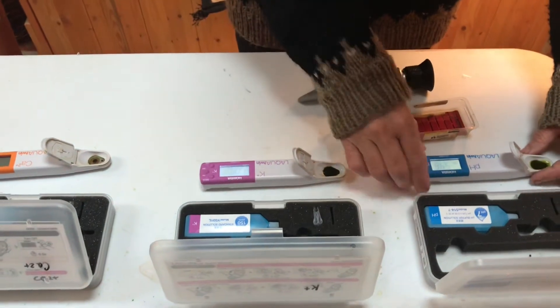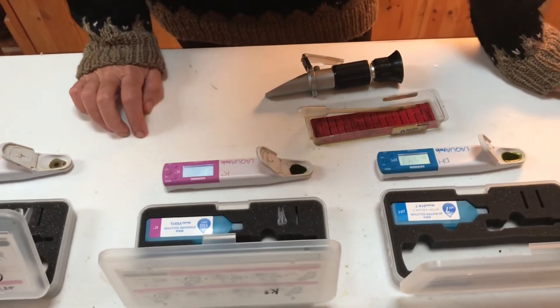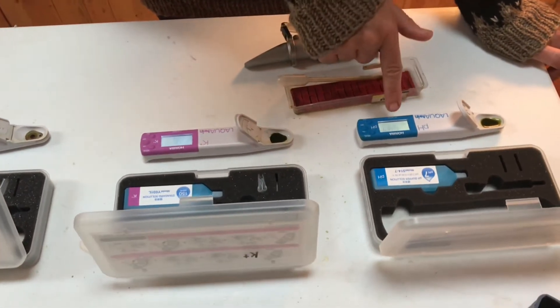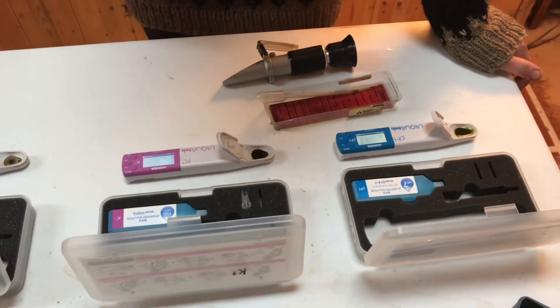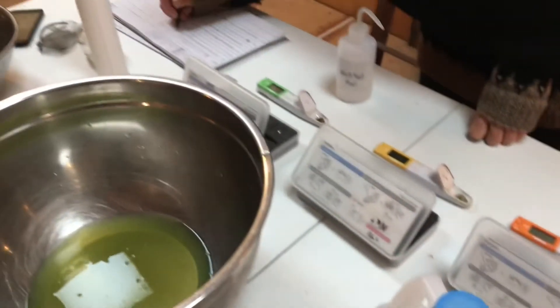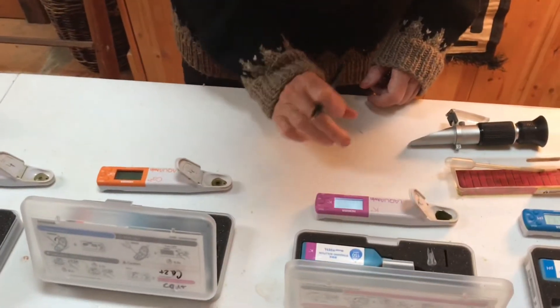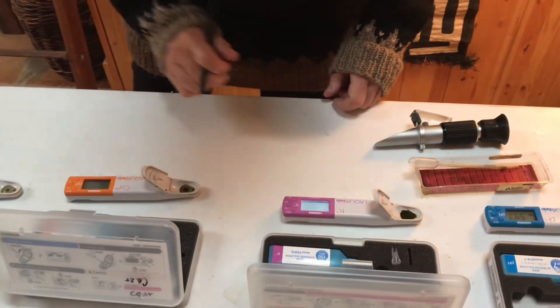The pH will come up and then the potassium level will come up. We see the happy face, so it shows that the pH is 5.47. We note that. The next one — 2100 for the potassium.